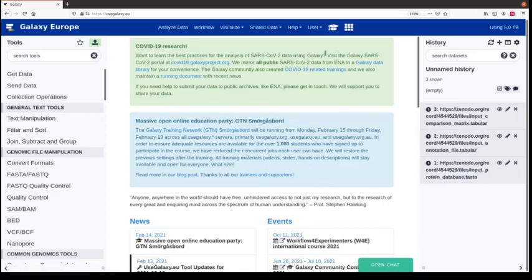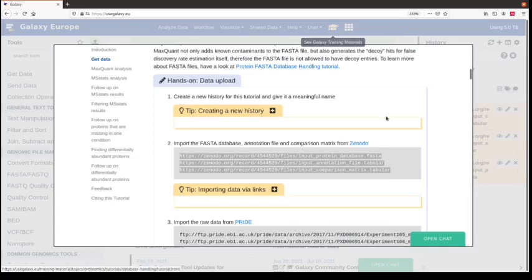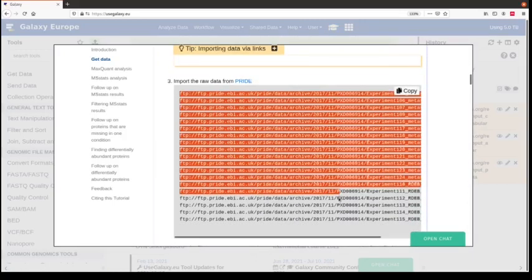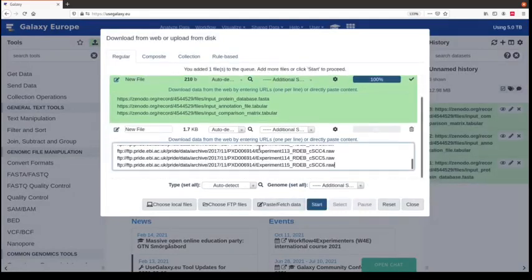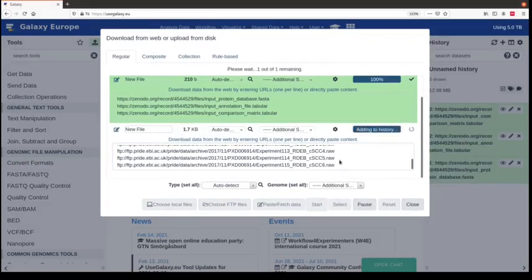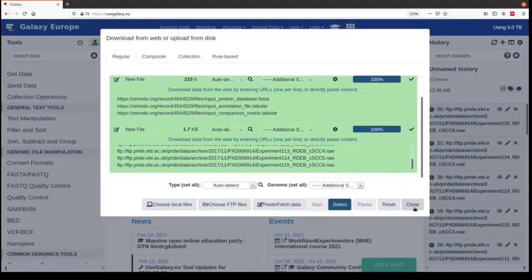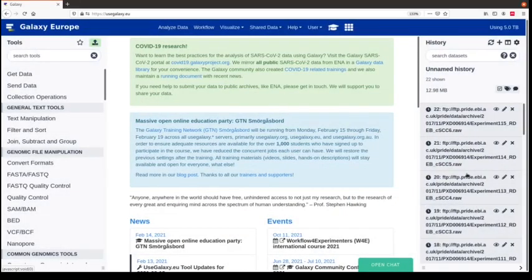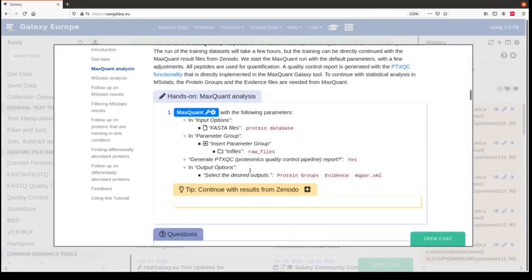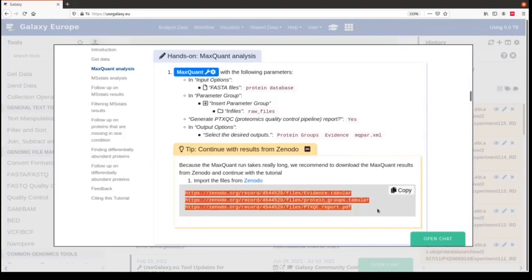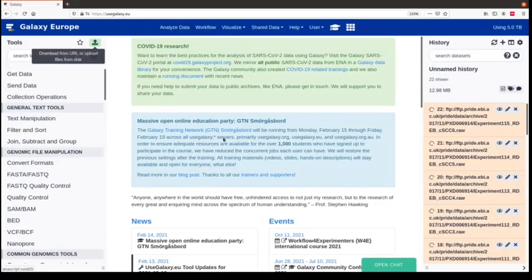We then continue with uploading the raw files. You have a direct link to the Galaxy training materials site where we can copy the links. This is raw data deposited in the PRIDE repository, which hosts publicly shared proteomics raw data. We have 19 raw data files and they take a long time to load and also a long time for the MaxQuant run. That's why we will already load the results of the MaxQuant run, which you can find at the end of the hands-on MaxQuant analysis box.